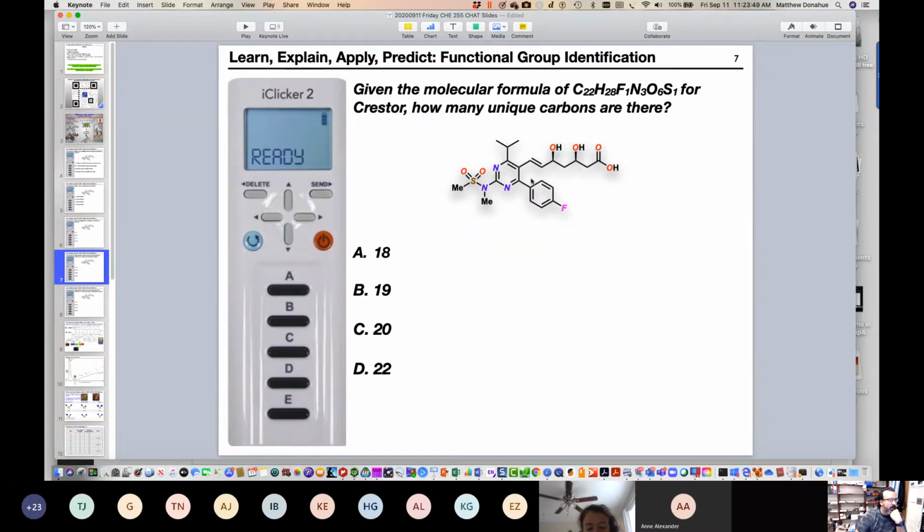8. Then let's go down to this ring. Let me write down 8 so I don't forget. Yes, because of symmetry. So look at just this ring. There are 6 total carbon atoms in this ring. Should we count them as 6, or what number should we count them as?